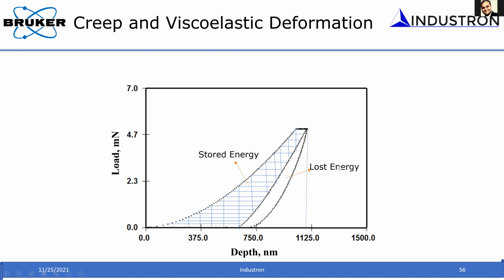So you have a storage and loss component when you do this mechanical measurement, and we call that the storage and loss model. In a simple analogy, it is equivalent to this. For example, say you have a rubber ball that you try to bounce onto the floor. When you drop it from a height, it doesn't recover to the same height. It recovers to some height, depending upon how much has been lost. Similar to that, you have a loss component and a storage component.